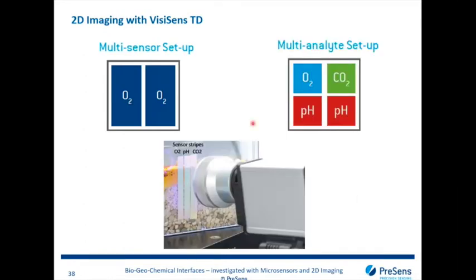Another big benefit is that you can combine, for example, multiple sensor parts or multiple sensors in one field of view, for example different small oxygen sensors where you expect some interesting things going on. Or you can also combine several sensor types in one field of view, as indicated down here below on this image, where a sensor stripe for oxygen, pH, and CO2 was placed in one field of view and recorded consecutively or simultaneously in one experiment.